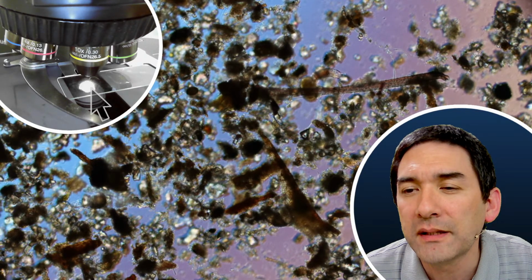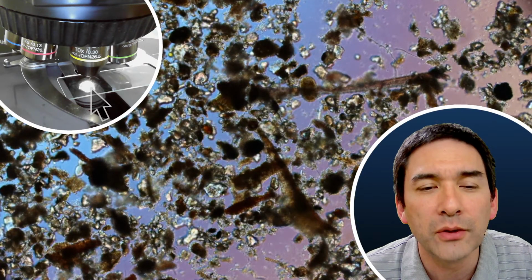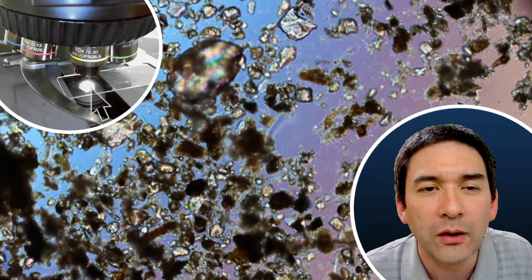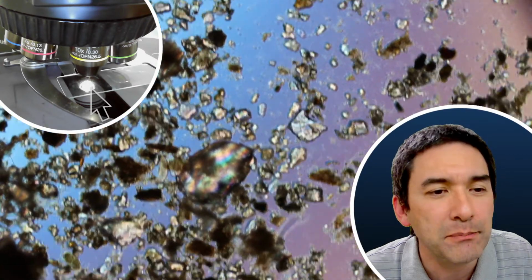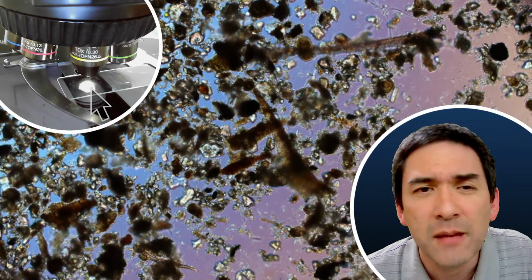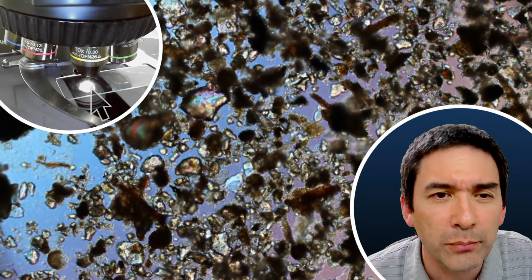How many megapixels is your microscope camera? I'm recording. My camera is able to record 4K, but this live stream right now is 1080p. I don't know how many megapixels the photo camera has, but the megapixels really are not the thing that is so important.